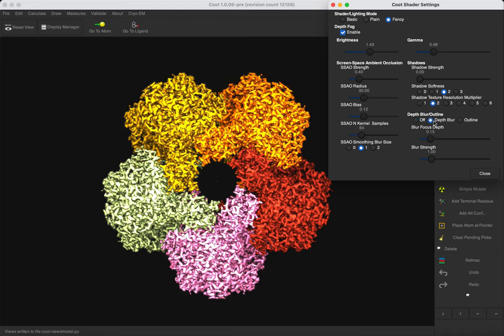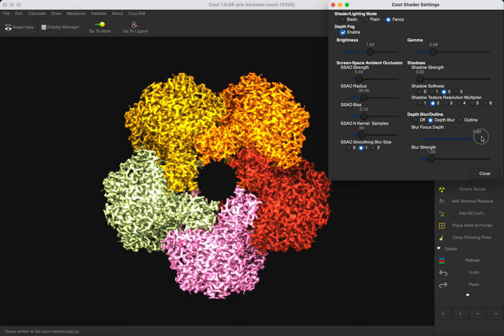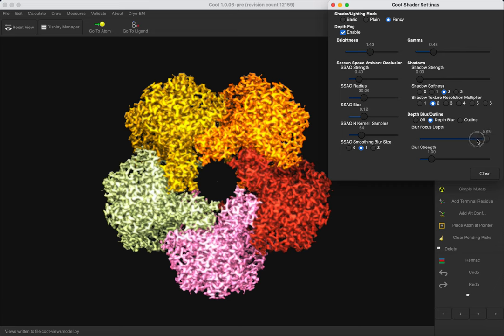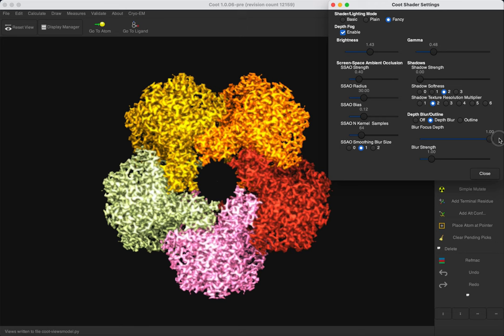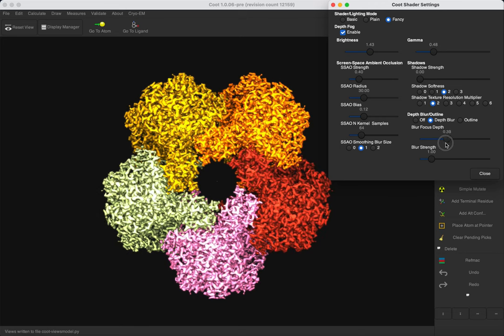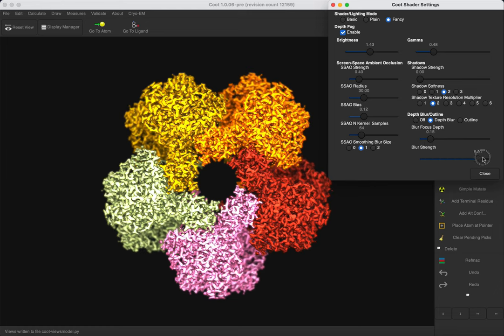We can also use the Depth Blur and Blur Focus Depth. Increasing it is going to focus our model.